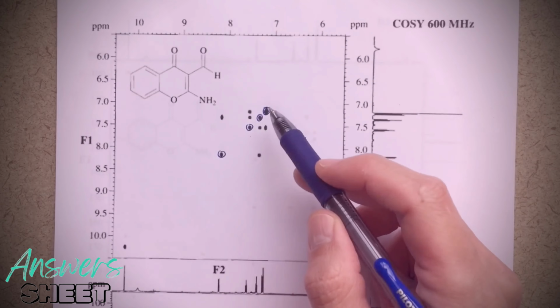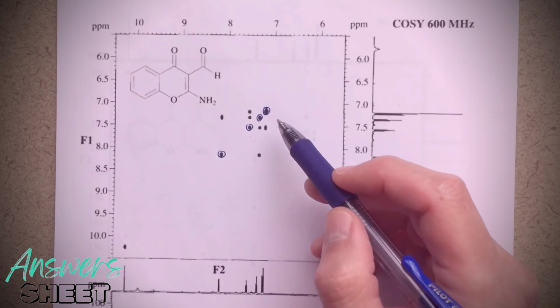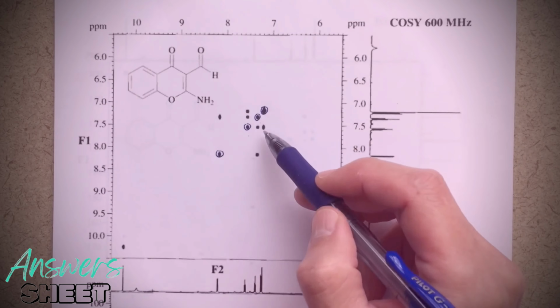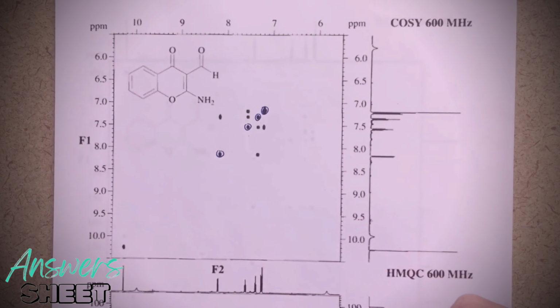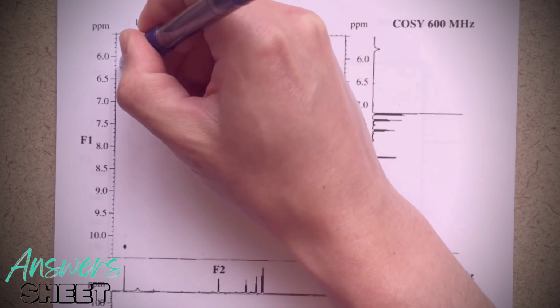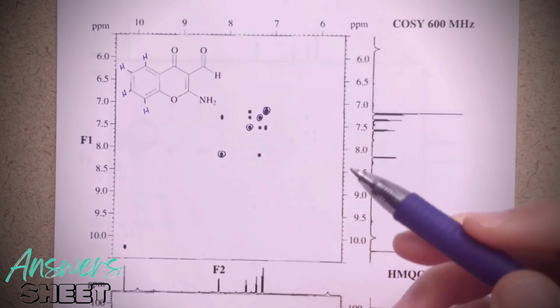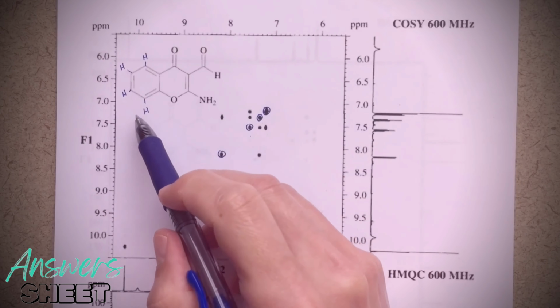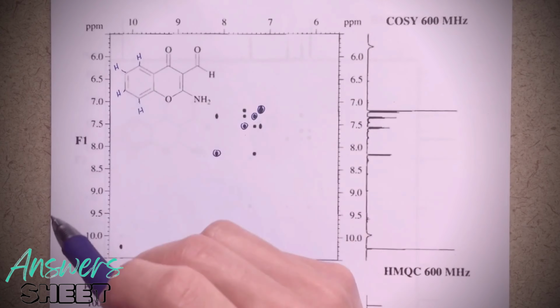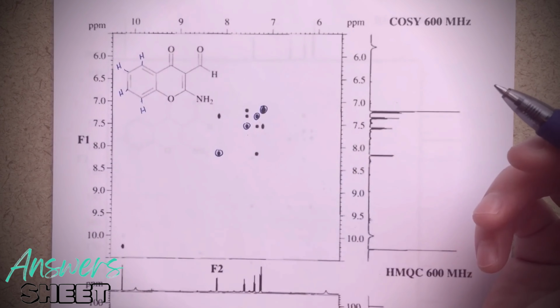Those don't really tell us anything, right? It just tells us that that signal is that signal. But then these 3 peaks here and these 3 peaks, it's sort of a mirror plane, that's going to be telling us what the correlations are. So over here, let's fill these protons back in, H, H, H, and H. And then we're going to be able to correlate this signal to the next signal, this signal to whatever else it's correlating to, I guess is a better way to put it.